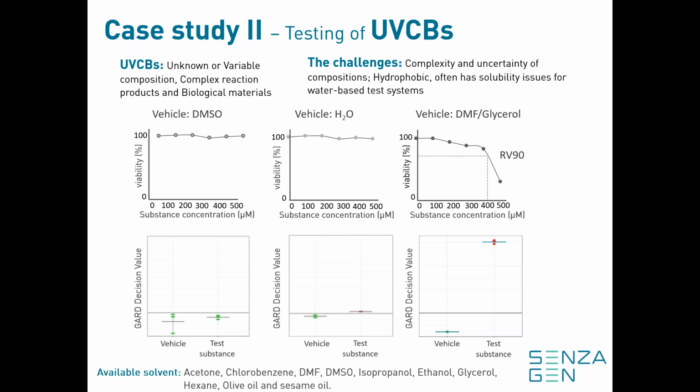So we do today have quite a broad portfolio of different solvents that we have shown are compatible with the GARD skin test system. And regarding the last three ones, the hexane, the olive oil, and the sesame oil, I would like to show a bit more data on these specific extraction vehicles later on when we talk about the medical device testing.